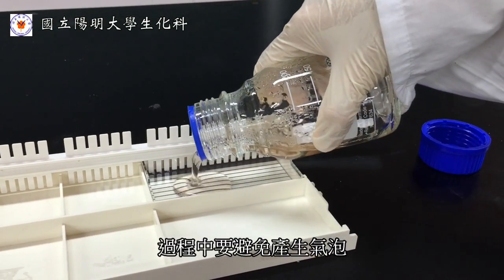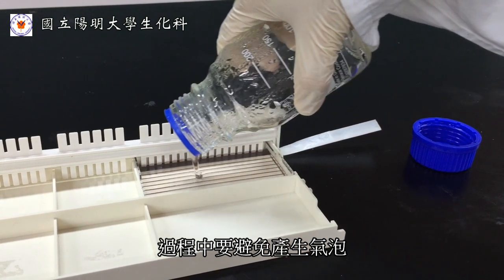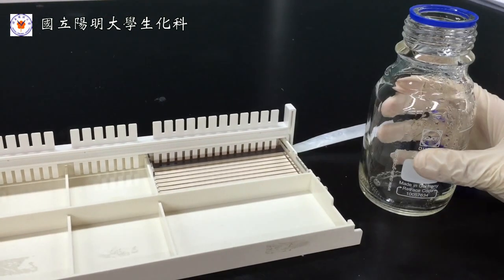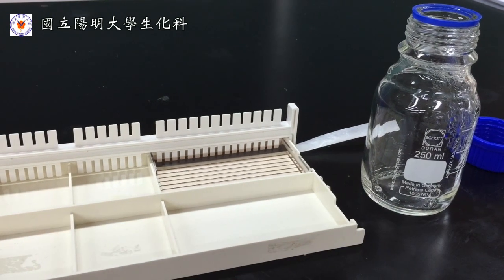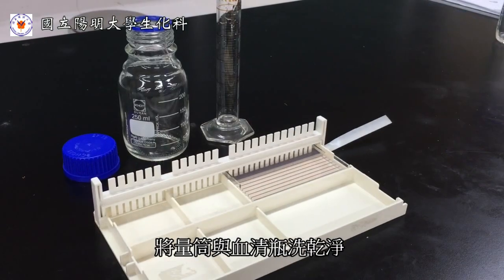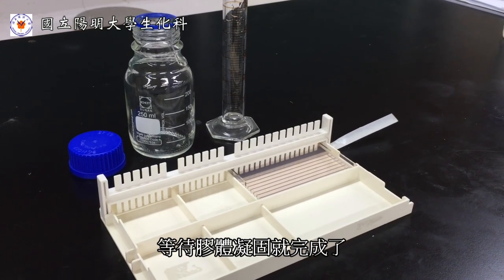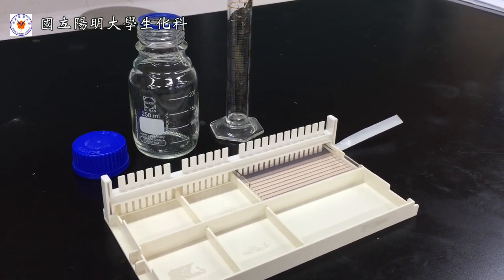No bubbles are welcome during the process. Do not forget to clean up the cylinders and bottles. Then wait for the gel to solidify, and the experiment is accomplished.